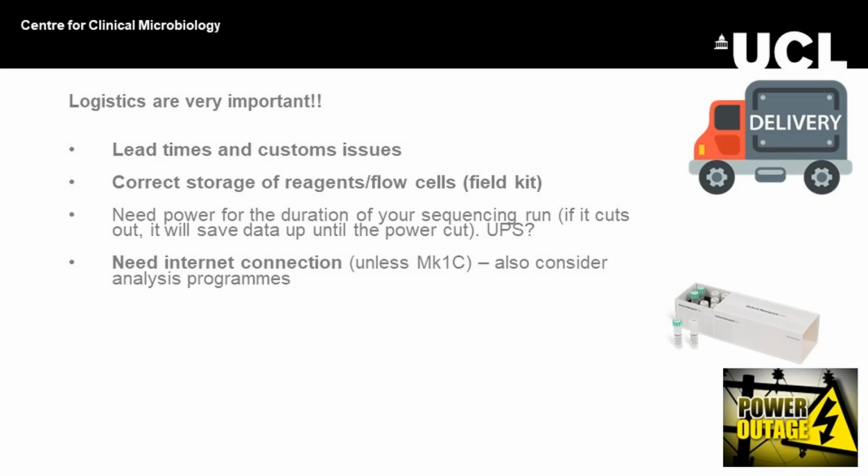You need power for the duration of your sequencing run. If you have power cuts frequently, it might be worth getting both a UPS, so an uninterruptible power supply, and a generator if that's not already something you have in your department.